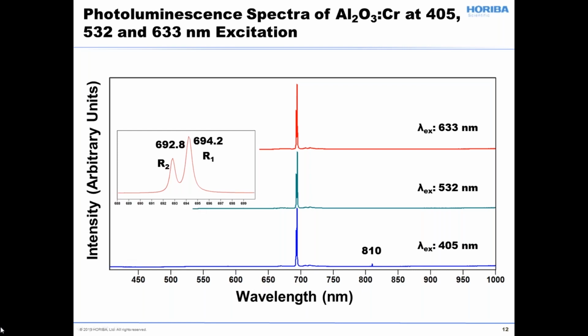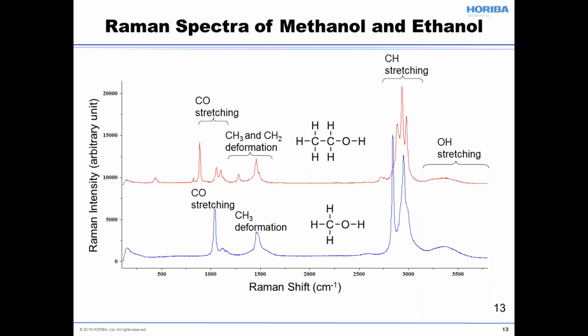In fact, in a slide coming up, I'll show you the in vapor phase Raman spectra, a full width half max of less than 1 reciprocal centimeter. That's the kind of resolution that you can get. All right, so that's photoluminescence. So we're finished with our little discussion of photoluminescence using a Raman spectrometer. Now let's just briefly cover some aspects of Raman spectroscopy.